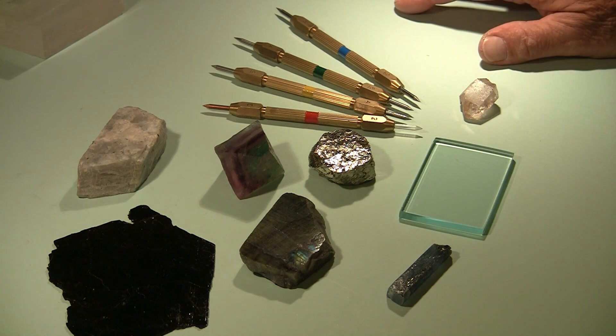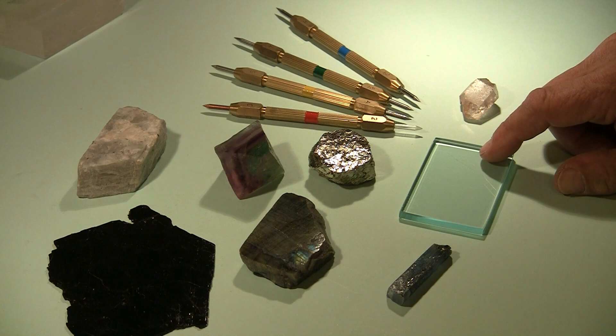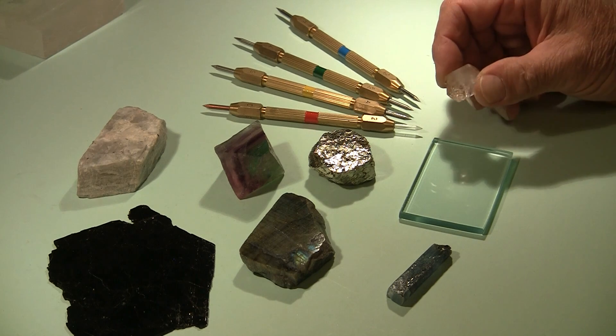In doing a hardness test, it's often very useful to start off with glass. Glass at a hardness of 5.5 is kind of in the middle of the hardness scale, so testing an unknown mineral on it divides it into two parts.